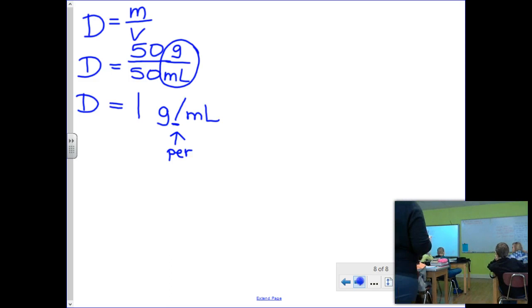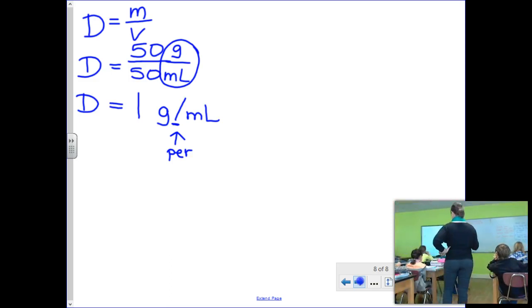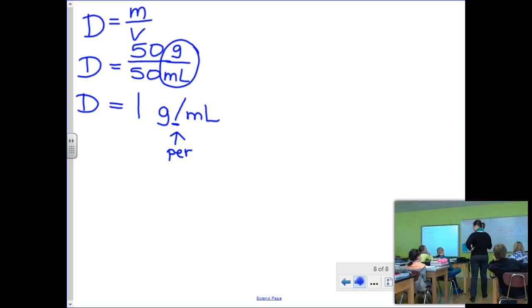Now, just tell me the units. Everybody on the count of 3, just your units. 1, 2, 3. One more time, because I'm not hearing everybody. 1, 2, 3. Grams per milliliter.